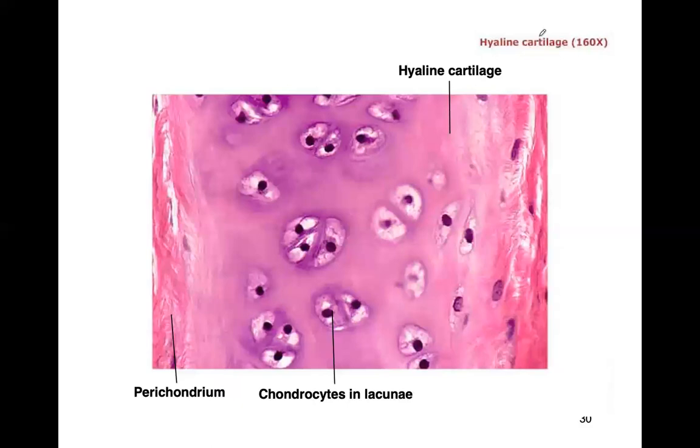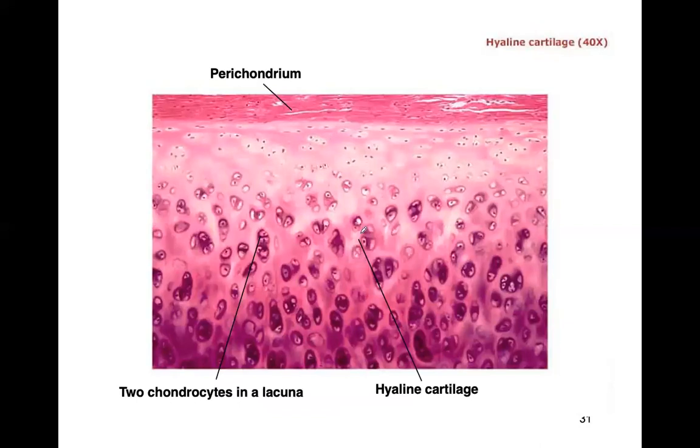Okay, now this is cartilage. This is hyaline cartilage, which is what we find at the end of the bones. These have a unique type of appearance. This is a cartilage cell called a chondrocyte. They look like raindrops, pretty translucent, clear raindrops. Hyaline cartilage has this look. No other cartilage has this type of appearance that looks like crystals or raindrops. Again, we see cells that are far apart from each other with lots of matrix in between. They're not closely packed together.